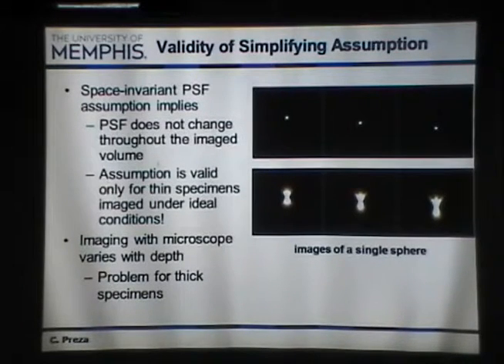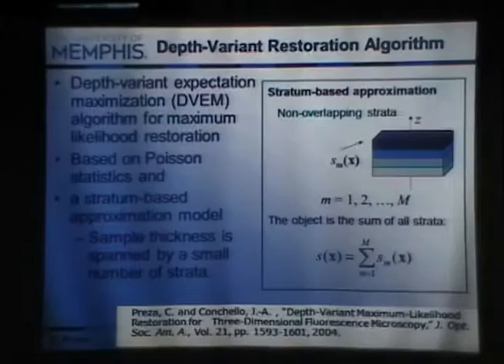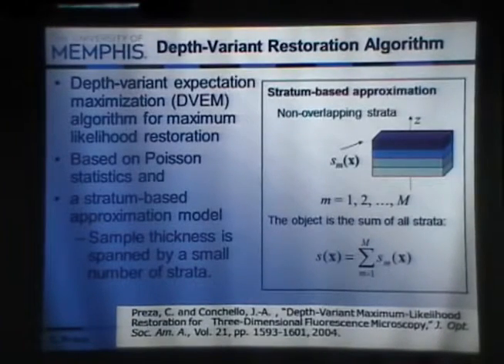Okay, so as I said, for many, many years, this kind of methodology was used. But now we want to be able to have successful results with thicker specimens, and since we know how to model this phenomenon, we want to use it and correct the images with it. So now I'm going to discuss how we use this strata-based model that I showed earlier to develop a new expectation maximization algorithm.